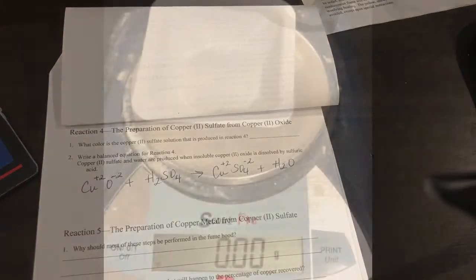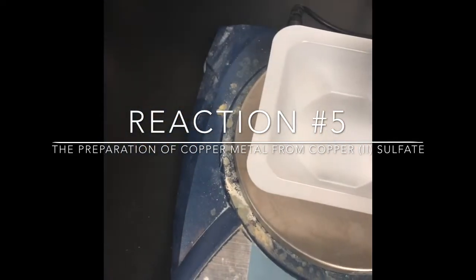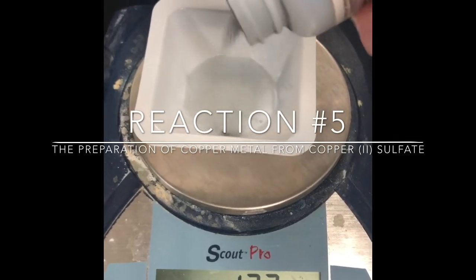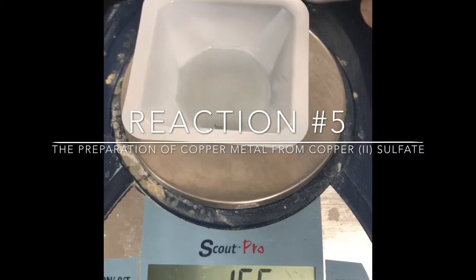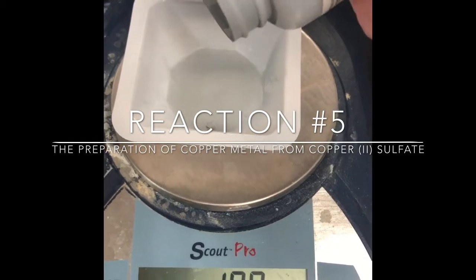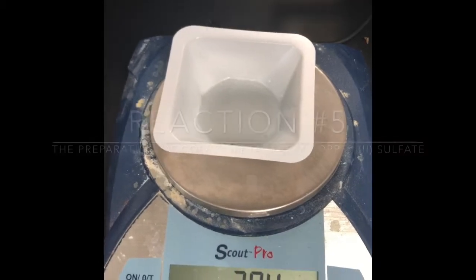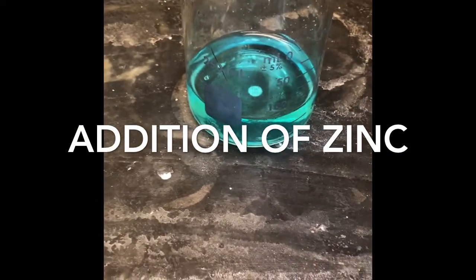So it'll be balanced. The next portion of our lab says we're going to measure out 2 grams of zinc. So I've already tared the balance and I'm going to sprinkle some zinc. Let's do a little. Okay, so we got 2.04 grams of zinc. That's pretty close. So it'll be good to go for our next portion. So I'm about to add the zinc all at once to the copper solution.